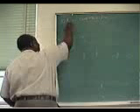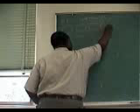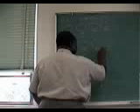And we're going to have 4 plates with 10,000 cells. And of course, we got to have a control. And then we're going to have one that you will irradiate 10 seconds, 20 seconds, and 40 seconds. And another group will have a control, and you'll irradiate them at 15 seconds, 30 seconds, and 60 seconds.